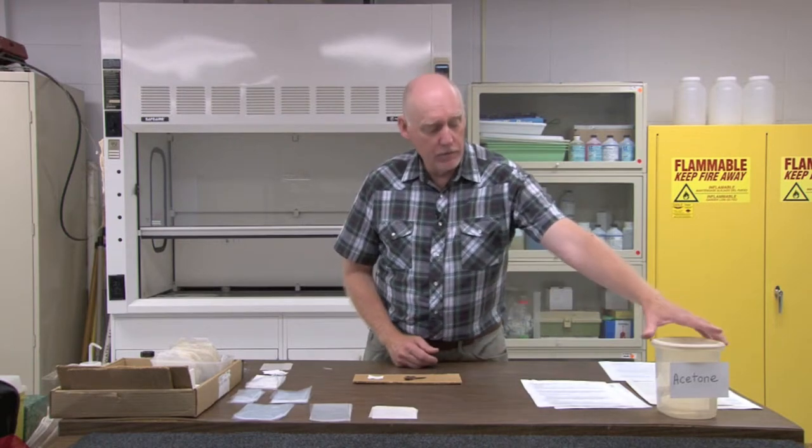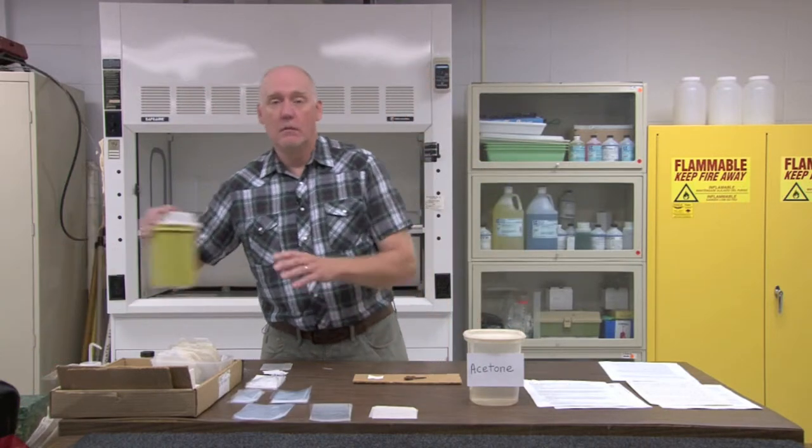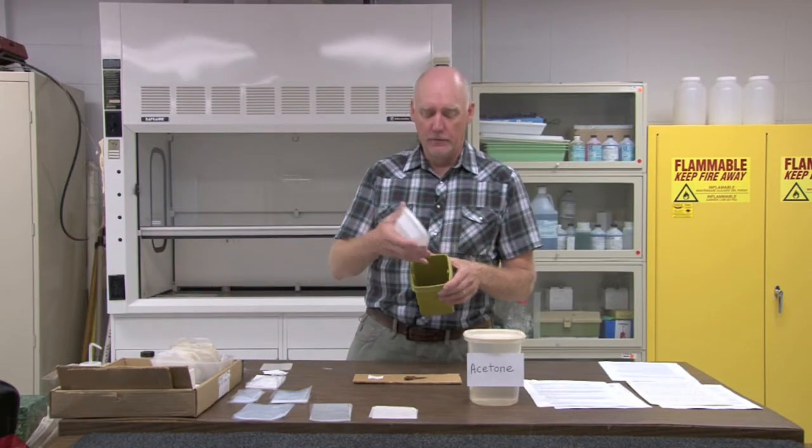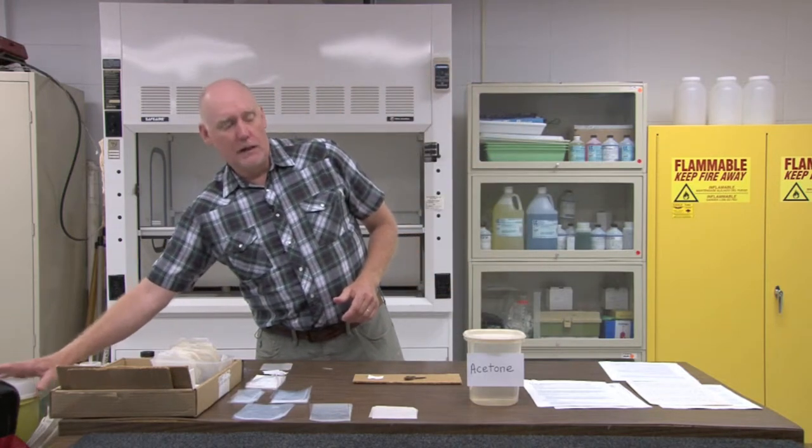What you'll need in order to do this are some various materials that I'll describe now. You'll need to purchase some acetone, which you can get at any large hardware store or department store, and put a few inches of it into a wide-mouth container — Rubbermaid or pickle jars work well for that purpose. Not all plastics will work; acetone will eat through some plastics, but Tupperware containers, Rubbermaid containers, and pickle jars all work quite well.